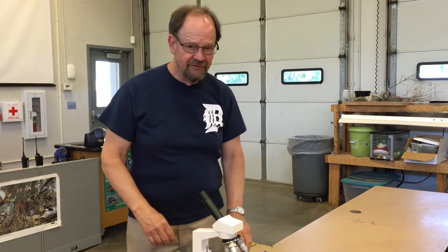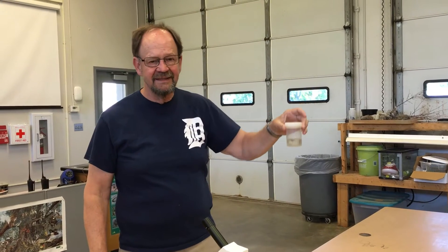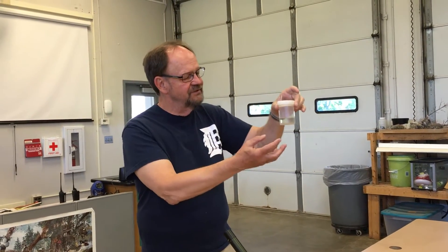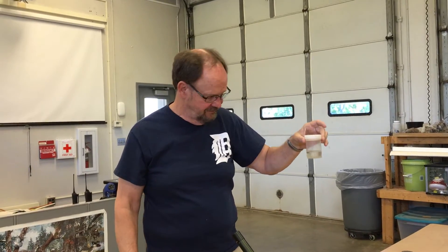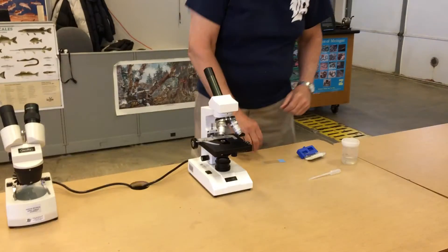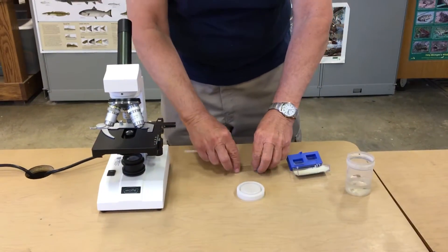We're going to make a slide from the specimens we collected with the plankton net. This has been sitting for a while so that gravity drops some of the specimens down, making it a little easier. We're going to use our compound microscope, and you're going to work generally in teams of two.